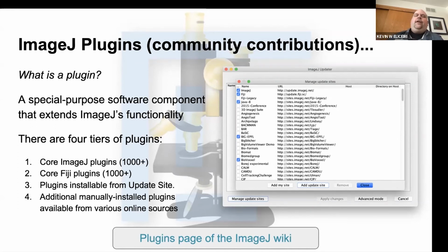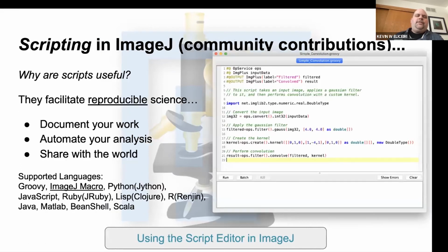One effort that I think has become really important is the idea of update sites. So any of you who run core facilities, you can actually update your plugins and manage them, but you can also run your own version of Fiji. So many people have made their own custom installs for their given place. And I think that's important.